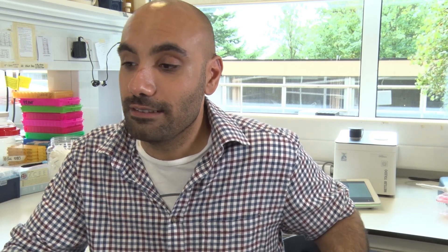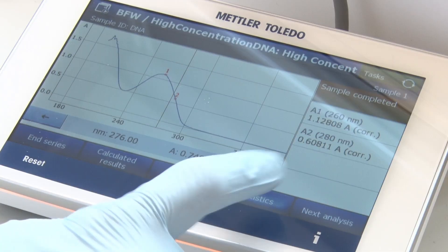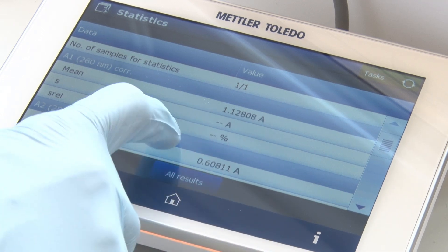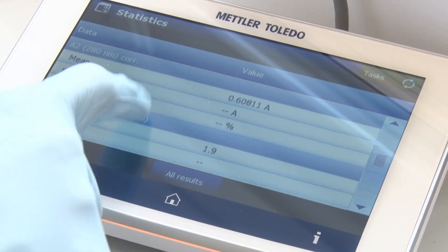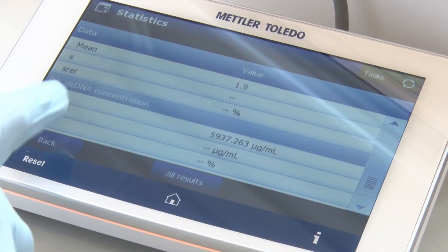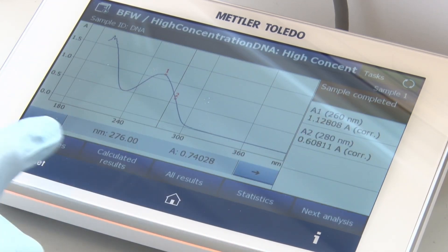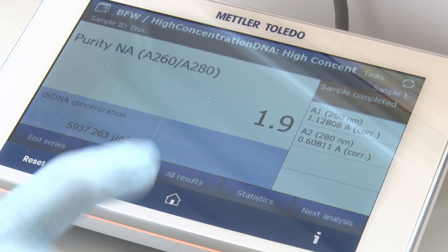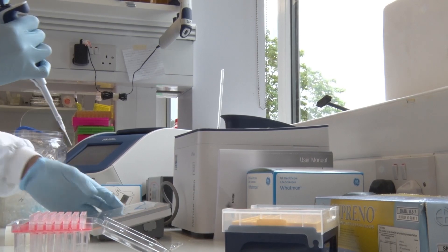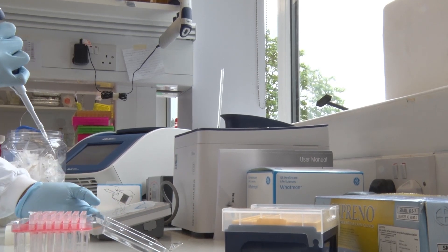What I like about it is that it's one unit — you don't have to turn on a separate computer and fire up software. You just press one button, it all turns on, and everything happens in one go.